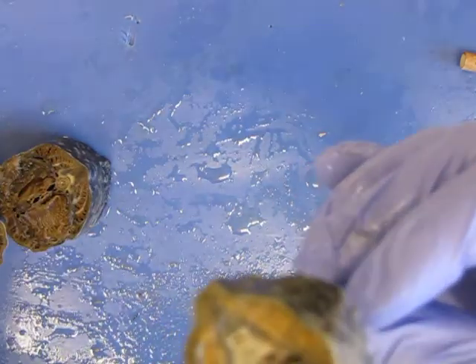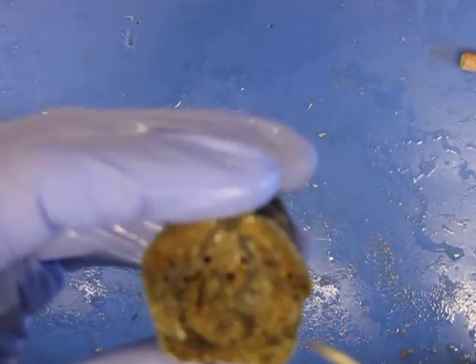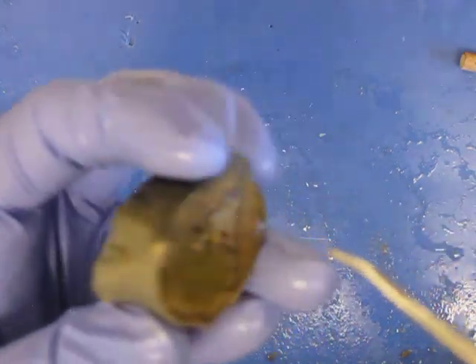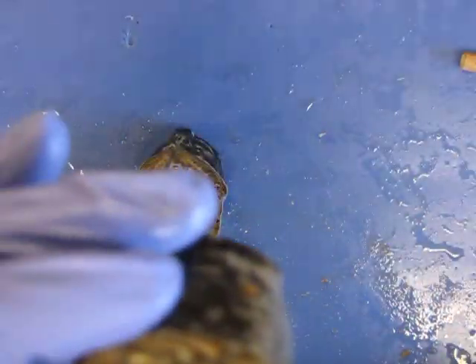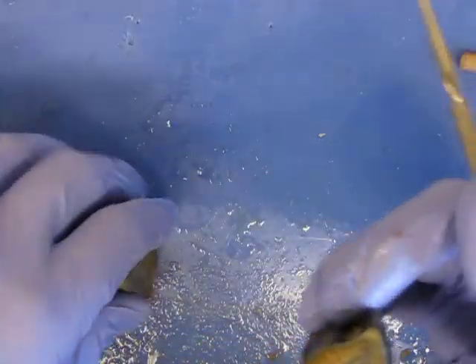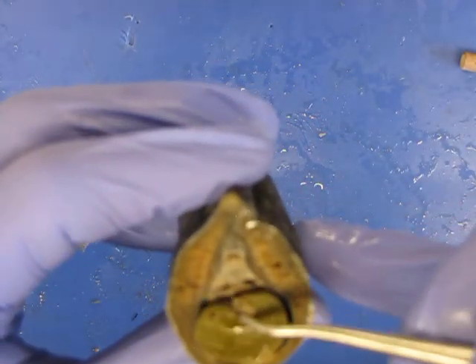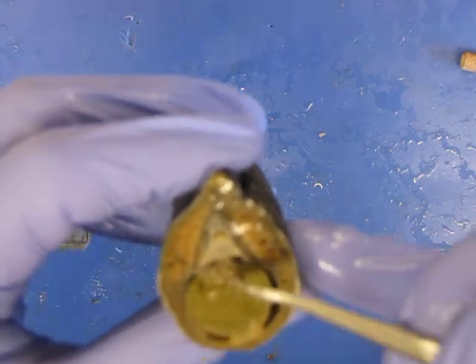Very carefully, see how it comes out dorsal to the liver? So that's intestine, and if you look at it, we can start to see the little ridges there. Okay, so still gills there, liver there. Gill pouches there, and gill pouches there. Okay, so liver, intestine is going to run dorsal to that.